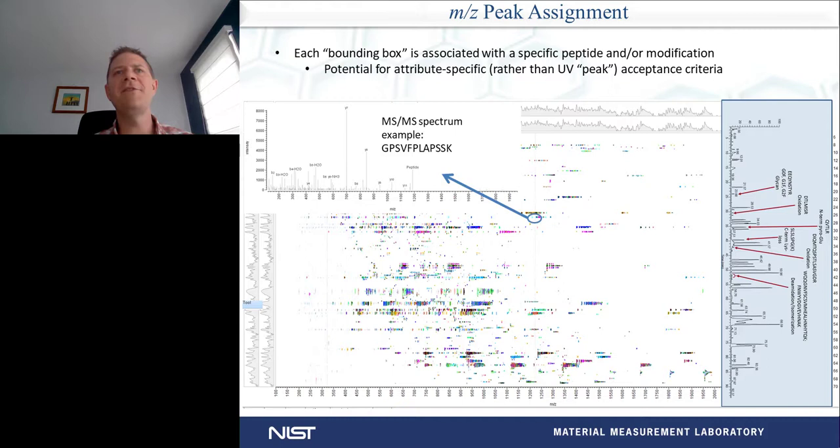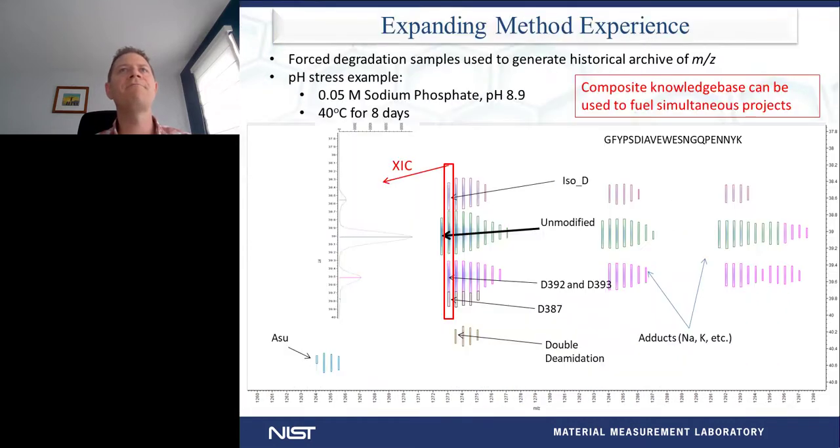from the NISTmAb material. It's safe to say that each of these individual spots is representative of a signal in the mass spectrum that we can then identify and associate with a given peptide. And once we've essentially identified these peptides, we can put bounding boxes from where that signal will appear, and we can continuously quantify that peptide based on its mass to charge instead of a UV signal, which is far less selective than all of this mass information that we're able to glean by using the mass spectrometer.